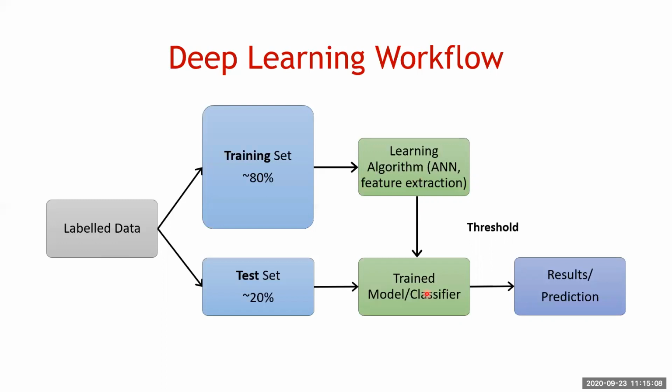At that point, you want to have a threshold. If you give it a threshold of 95%, the model has to reach that. Once it does, you continue tweaking and optimizing, and then and only then you push it through your test set, your evaluation set, which is only seen once, never at all before. The training set gets used many, many times to build that model.